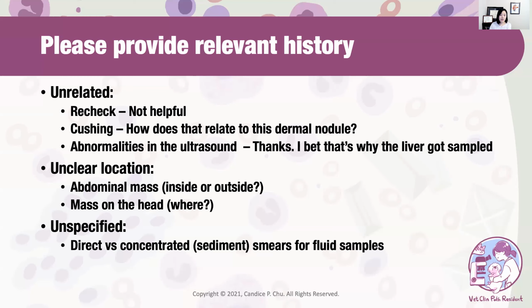And then the other thing that would not be a problem in the teaching hospital, but when you graduate and work in the clinic, be sure that if you're submitting slides made from a fluid sample, you specify whether this is a direct smear versus a concentrated smear. Because if you submit a concentrated smear, we take a look and find that the cellularity is increased, and we thought you were submitting a direct smear, that would change our interpretation.